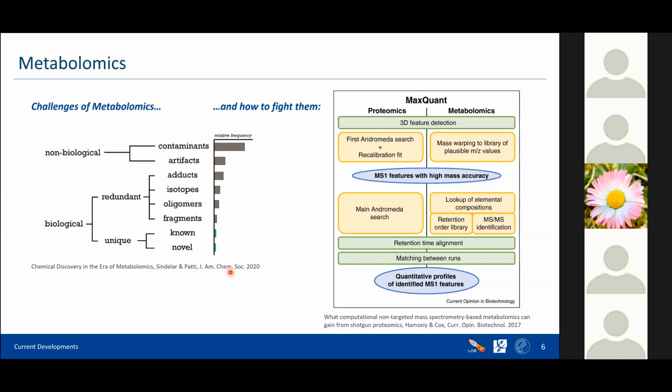But it can also be that some metabolites, before being put in the machine or even in the machine, reacted. So they combined to new relatively small molecules, but that's not something that is actually there in the cell. That we might call, for example, adducts.